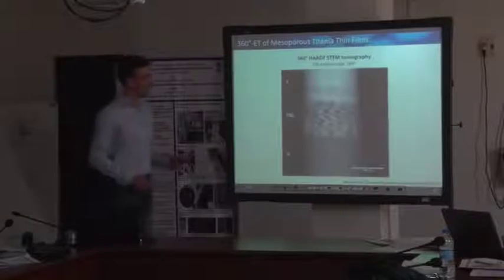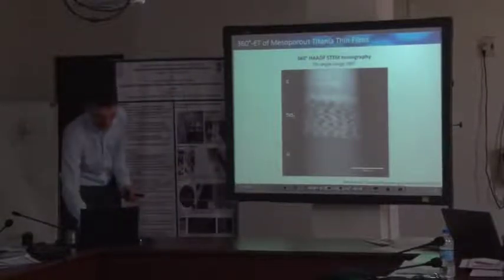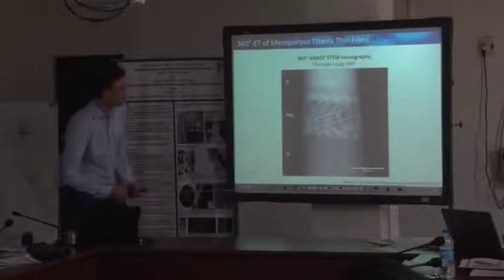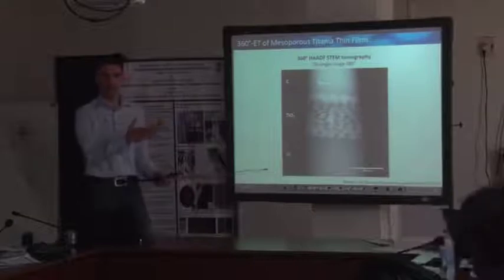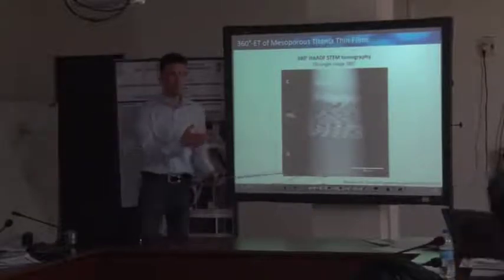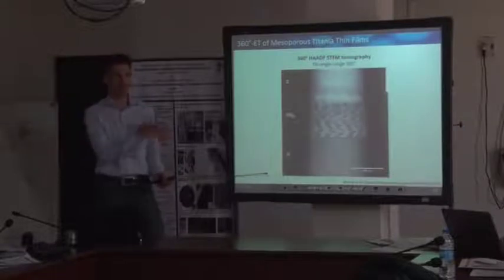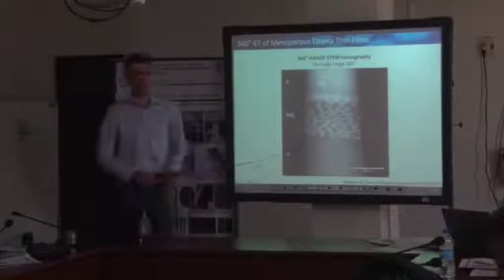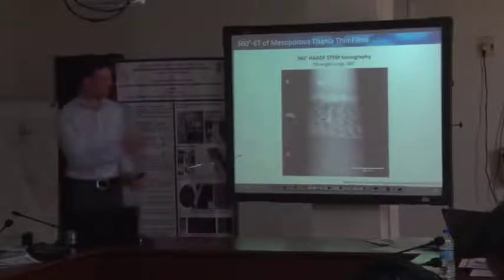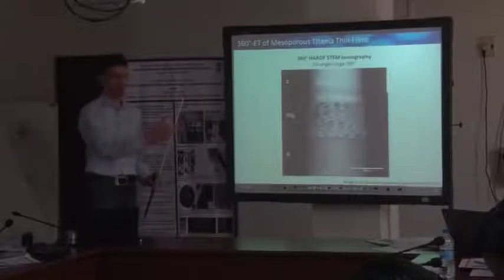You already saw that here in this tilt series, that there are some intensity fluctuations. Do you see that? So sometimes it's just brighter and darker, meaning that in principle, this monotone requirement is not fulfilled here. So we don't have this perfectly monotone function, or the intensity doesn't exclusively depend on the local density of the material.